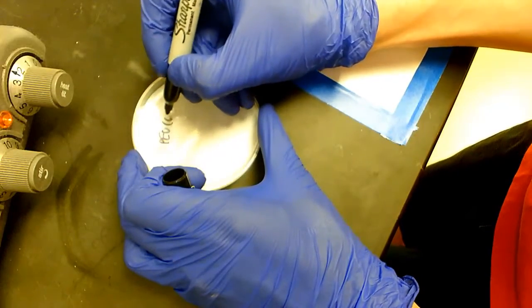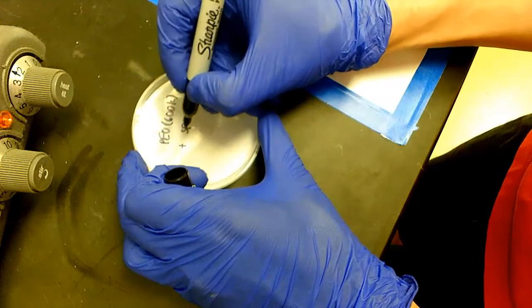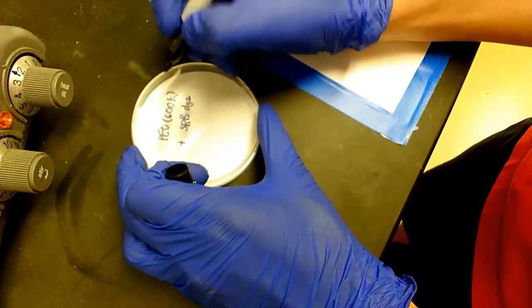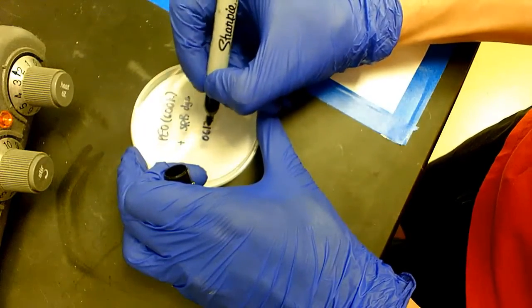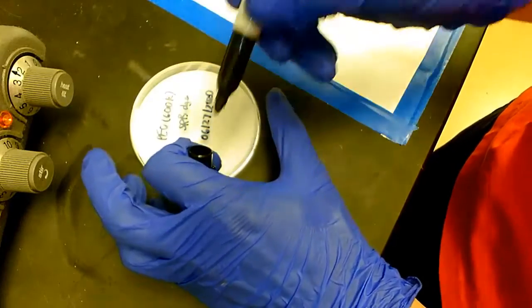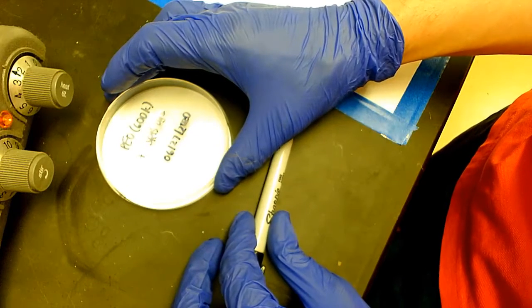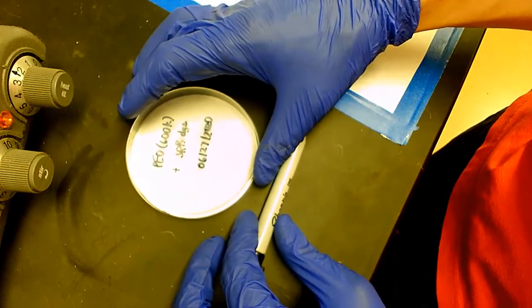You can say this is 600K plus SRB dye, and you can as well put a date, and maybe your name, but this is just optional, right? And then now we can put this one into a vacuum desiccator, and then store it until you're ready for the measurement, right? So that's all.